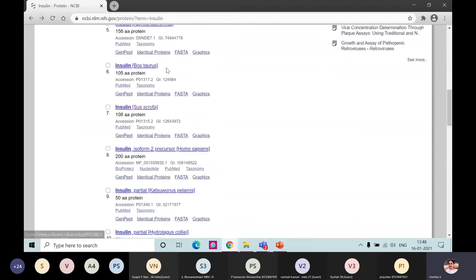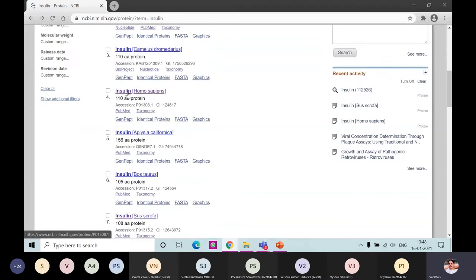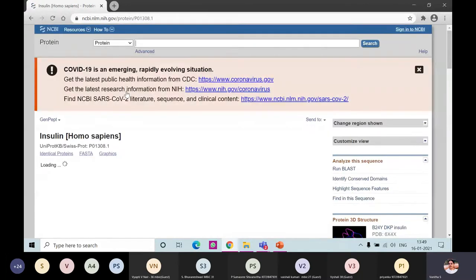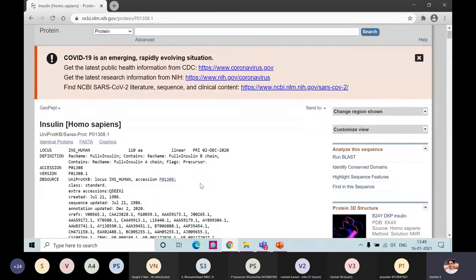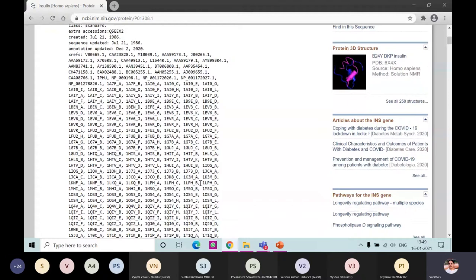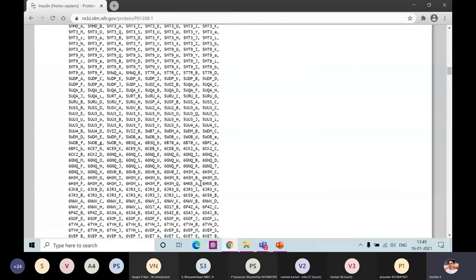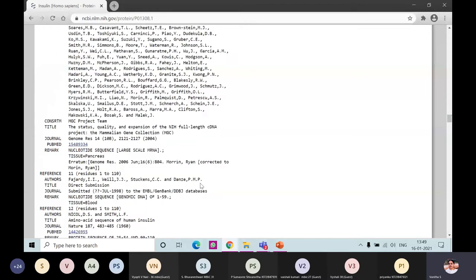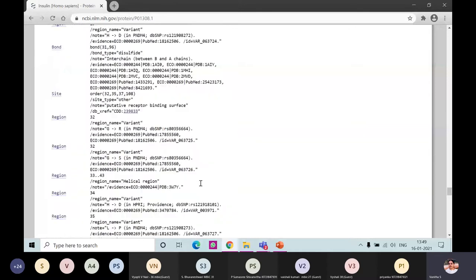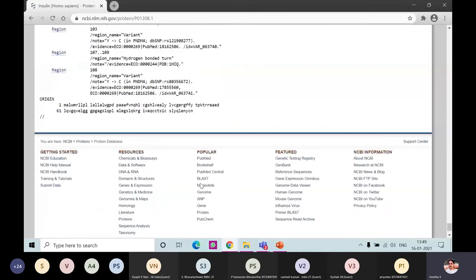Listen carefully - you have to click only on the insulin protein entry; don't click anywhere else or it will take you somewhere else. I am clicking on insulin protein of Homo sapiens. It will take a few seconds for the page to open. Once it opens, it gives a lot of information deposited by the authors. Scroll down - go down and down until you find the amino acid sequence. You should know the single-letter codes for all 20 amino acids to identify it.